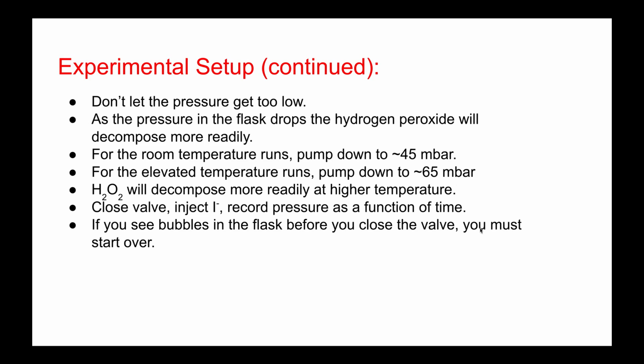If you are pumping down and you start to see bubbles in your flask, well, you have to start over. Your H2O2 has begun to decompose. That error happens often at elevated temperatures, since depending on the temperature of your solution, the H2O2 will break down at higher and higher pressures, before you get to lower pressures.